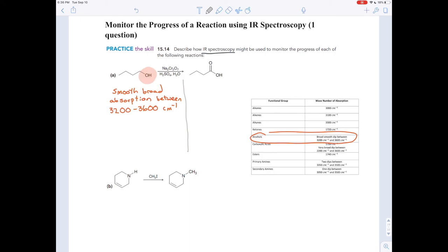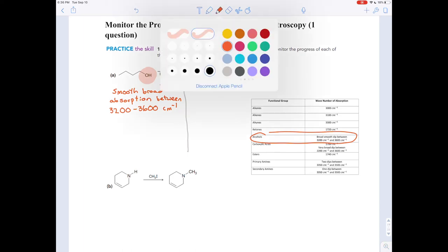You'd have other absorptions. You'd have that classic absorption just to the right of 3,000 because you have sp3 hybridized carbons with hydrogens on them. But those will also appear in your product, so they won't help you distinguish between the two. So, we'll focus on the functional groups, especially the ones that change.